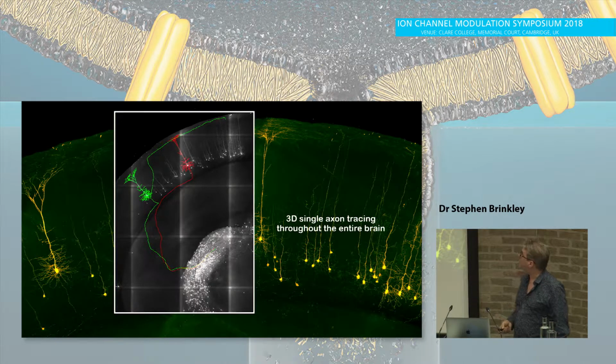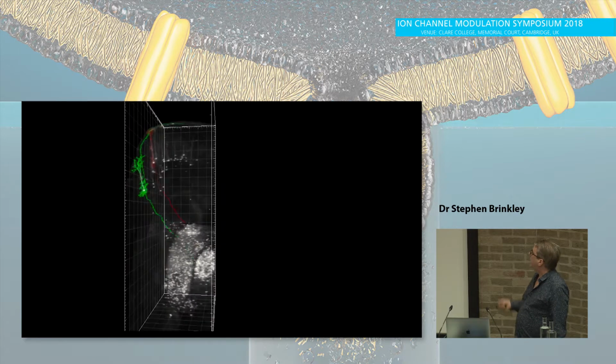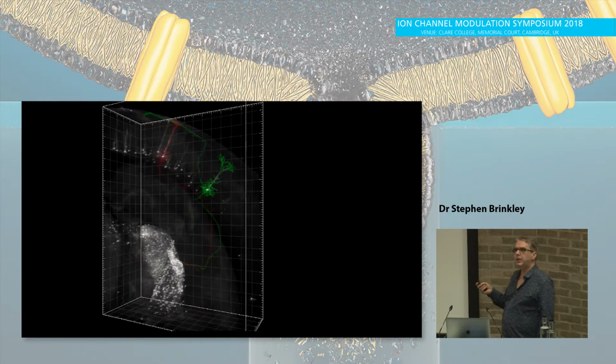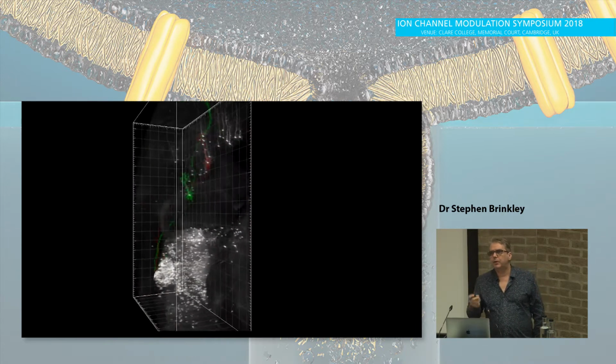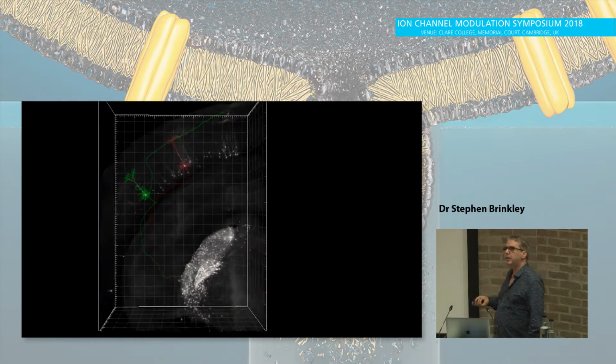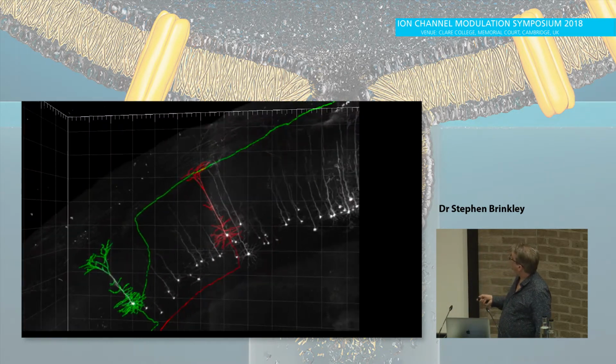Beautiful data we can get out of this, and of course this is the other thing we can do. Because we've got micron resolution, we can single trace axons throughout the entire brain. So this is a small section of the brain. This is actually from a collaboration with Alessio De Lego in King's. He's really good at rabies virus tracing, and we're using the SOX14 as our seed and looking at the inputs onto the SOX14 neurons and tracing these cortical neurons here.